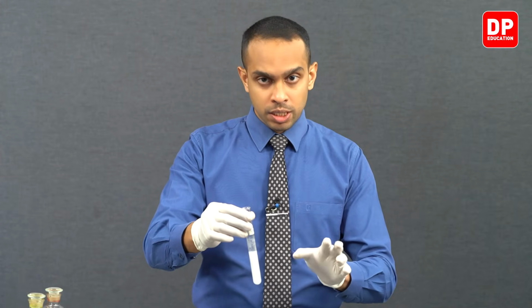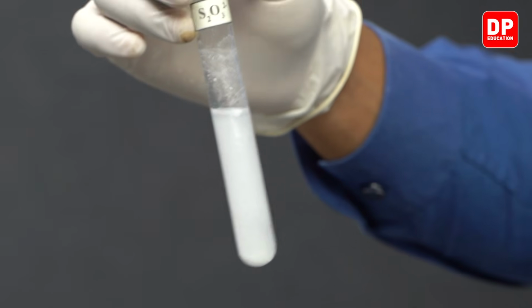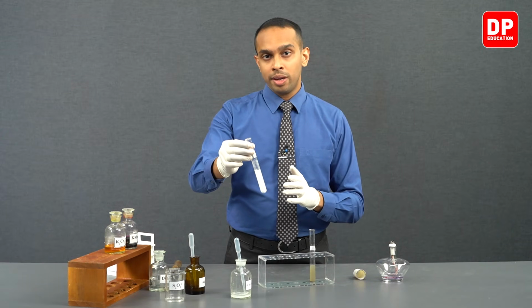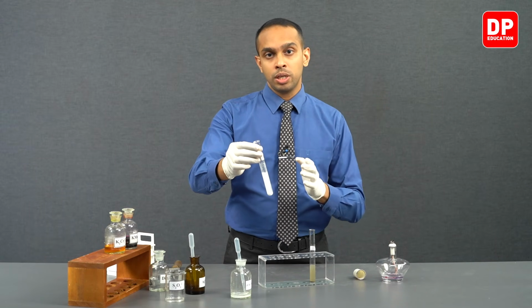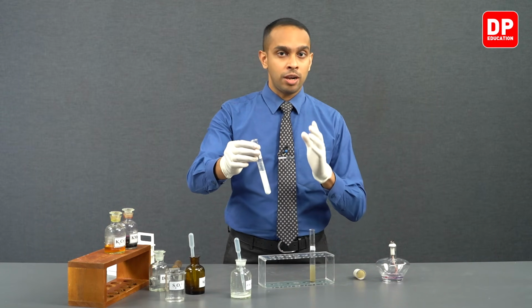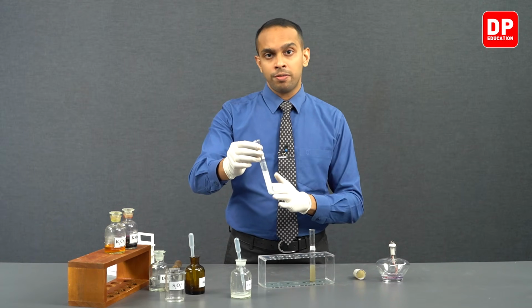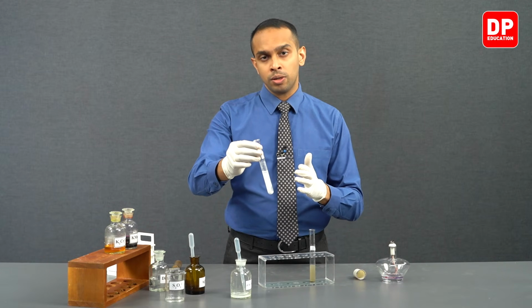Now students, we have mixed the solution. You can see the precipitate is now dispersed throughout this aqueous medium. We observed that when lead acetate was added to sodium thiosulfate or thiosulfate ion solutions, we saw the formation of lead thiosulfate, which is a white color precipitate. It was a stable precipitate. It did not undergo decomposition.